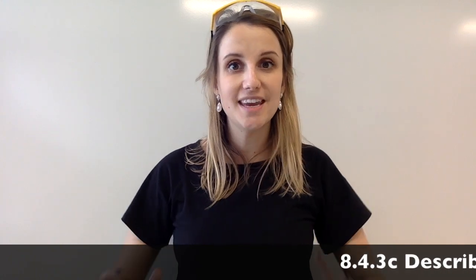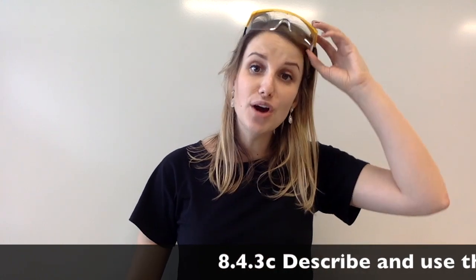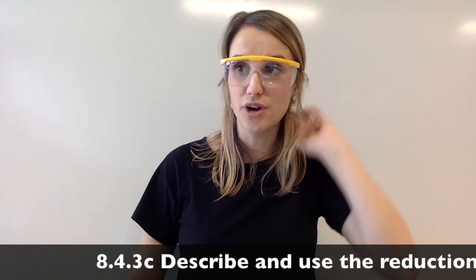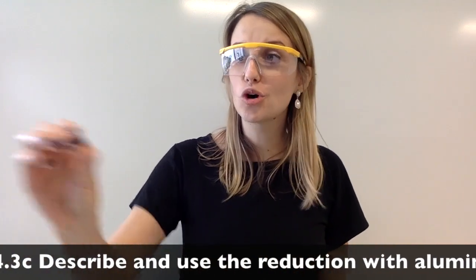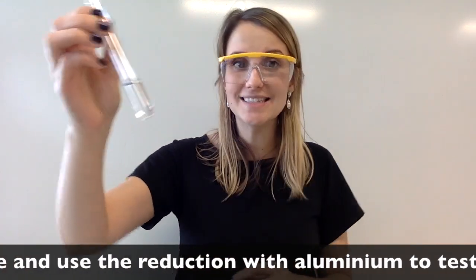Let's talk about the test for the nitrate ions. Now there is no direct way to test for nitrate ions and it's one of the more complex tests, so let's get started.